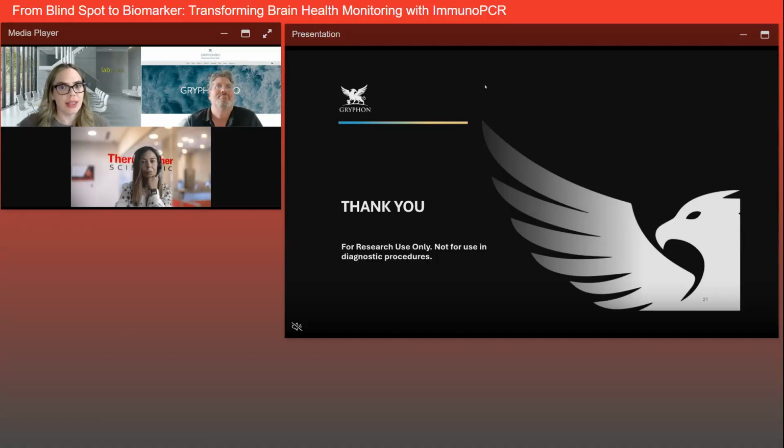Fantastic. Thank you. The next question that we have here says, how do you see mass spectrometry complementing ImmunoPCR? Yeah, I think it's a really interesting question for me. I spent most of my career doing mass spectrometry and love the fact that you can find post-translational modifications of proteins by LC-MS, and it's sequence specific. So the way that we use it is we'll commonly do proteomics discovery work, both with ImmunoPCR and mass spectrometry for brain tissue and CSF, for example.